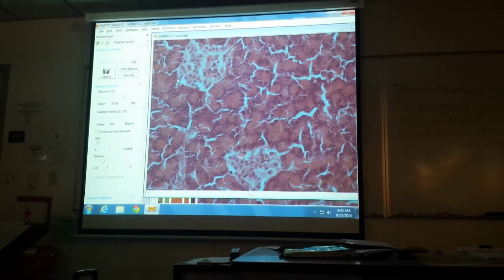So do you see two? Yes. Now, many of you seem confident. You can show me everything but this when it's your turn to show me. You have to have some discipline in your knowledge. You can't just show anything that stands out. You have to know that it's these clumps of cells that we're looking for here. These have the endocrine functions. So I want to move on.